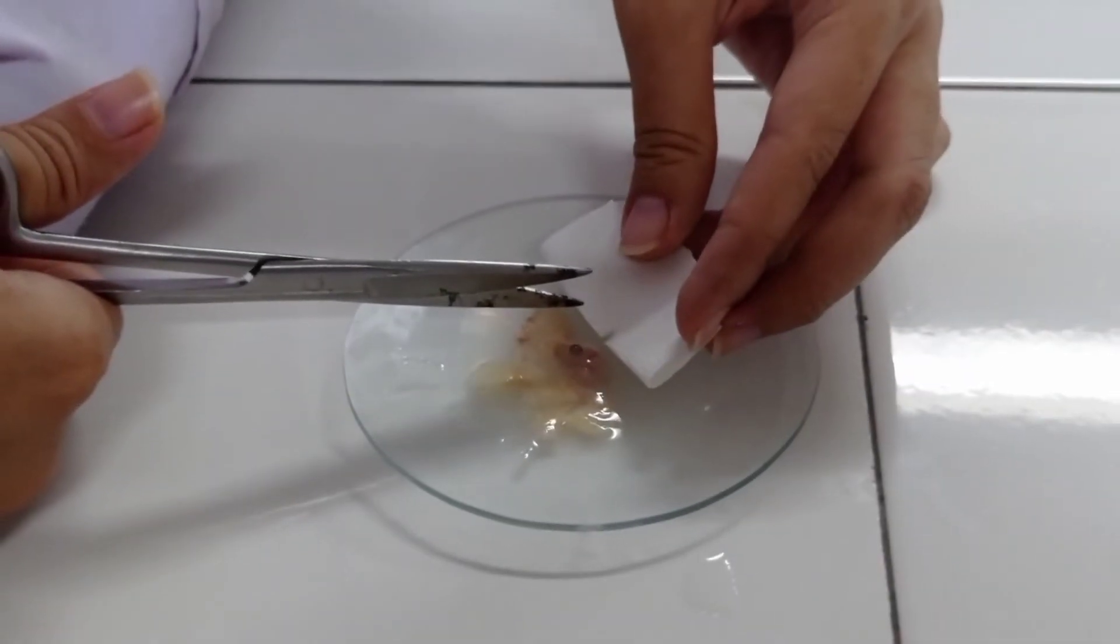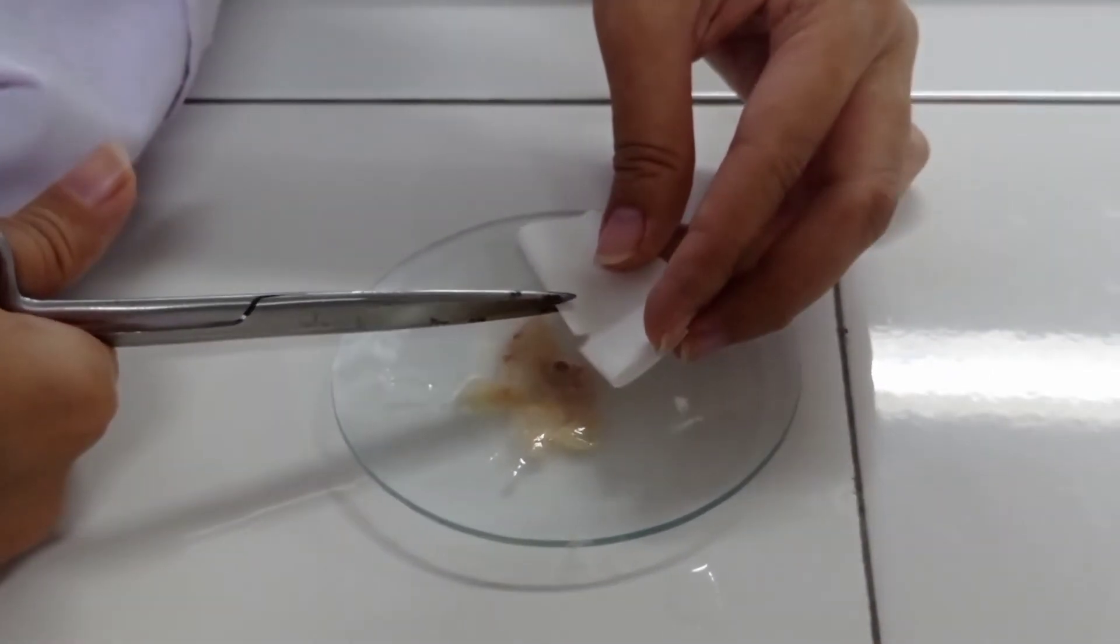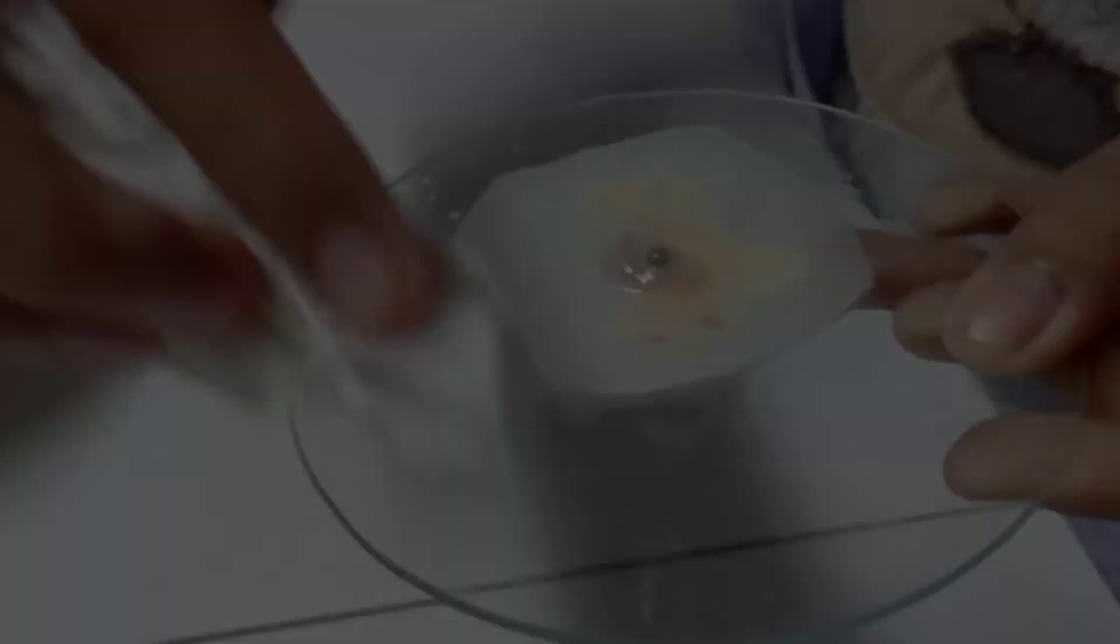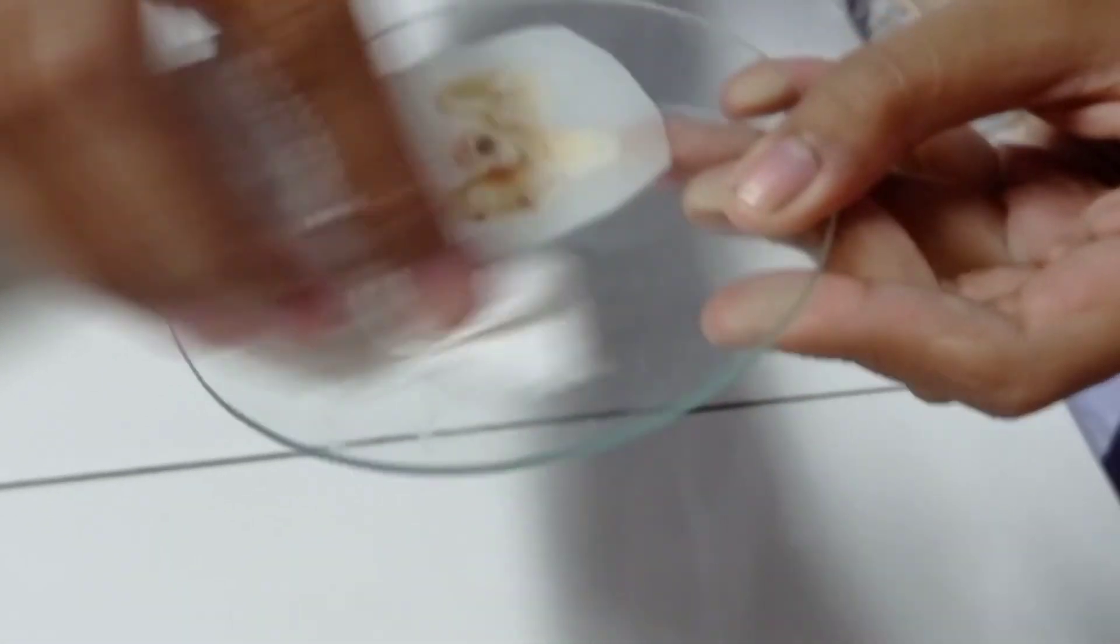Langkah ke sembilan, yaitu menyiapkan kertas saring dengan ukuran yang sesuai dengan embryo, serta dibuat membentuk seperti cincin yang mengelilingi embryo seperti pada video ini.